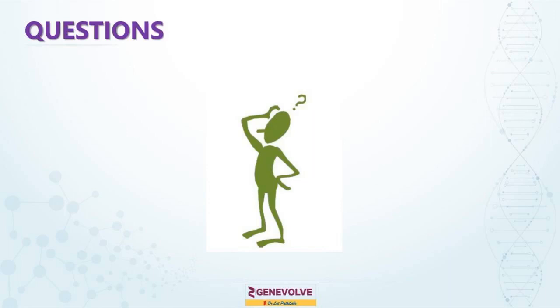The second question which Dipanjana has is, what about paired end reads when compared? So Ion AmpliSeq doesn't have a paired end read technology, while Illumina does paired end. So how do you compare the two? So maybe Rebecca, if you can compare it. I'm not sure I fully understand the question. So this is about paired end reads of Illumina versus the technology which AmpliSeq, the Thermo Fisher S5, is using.